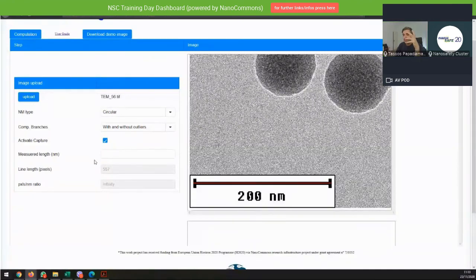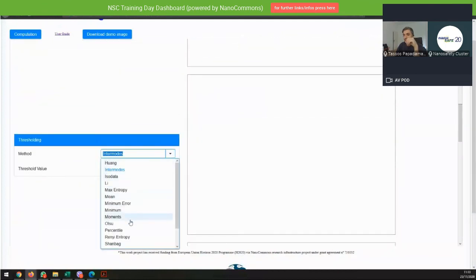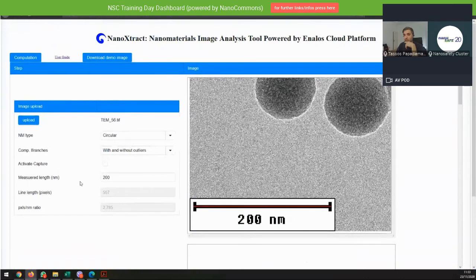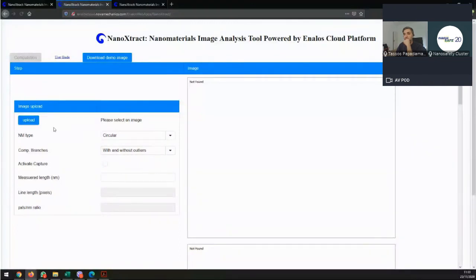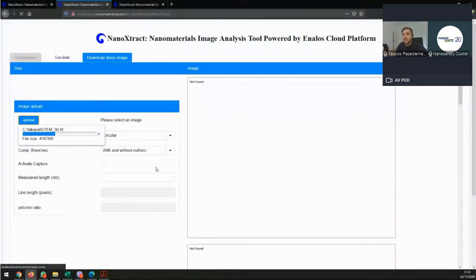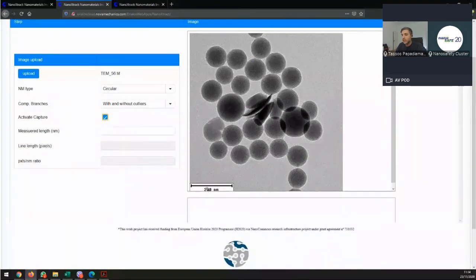So we pick the scale, we can tick, and then wait. Okay, let's run it with these settings now. We'll probably get an error here. We'll see how it goes. And also, I would like to run the same image, but making the mistake of not actually identifying it correctly in terms of scale. So as you can see here, the magnifying glass is here, but if you go a bit higher, you may not get it.